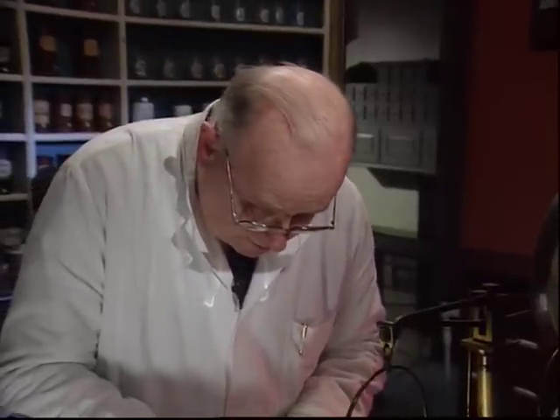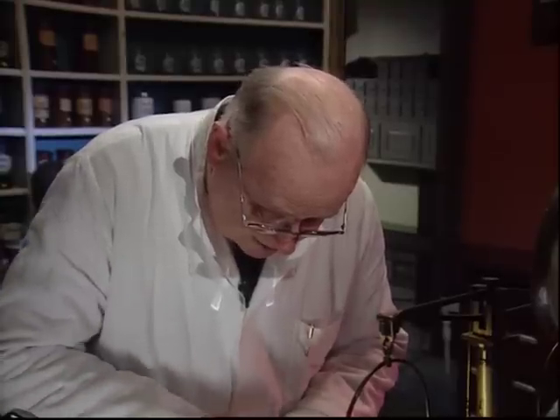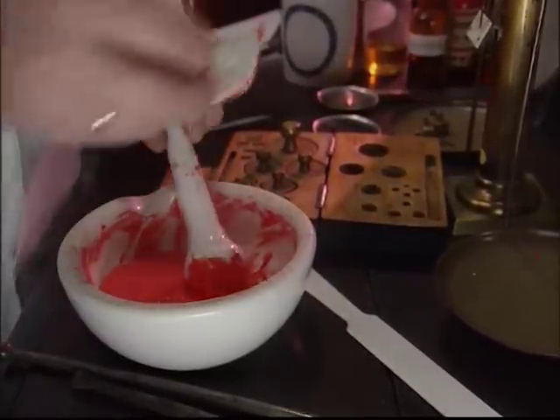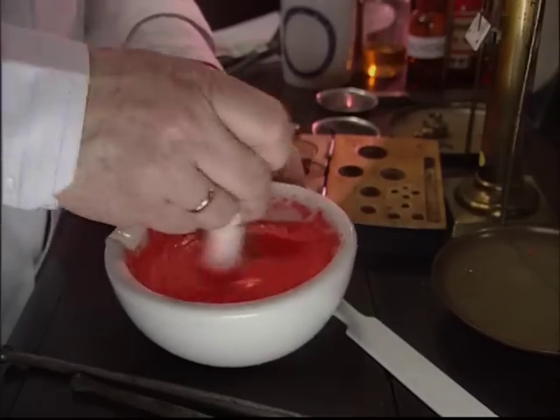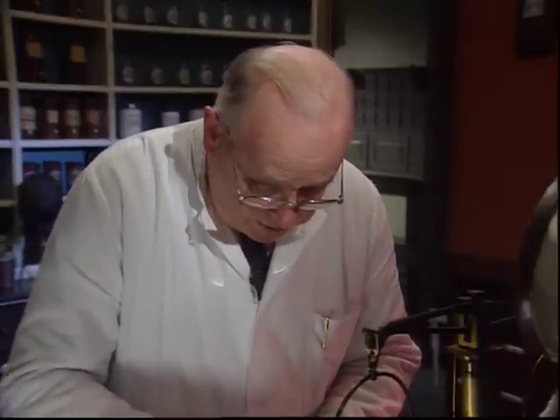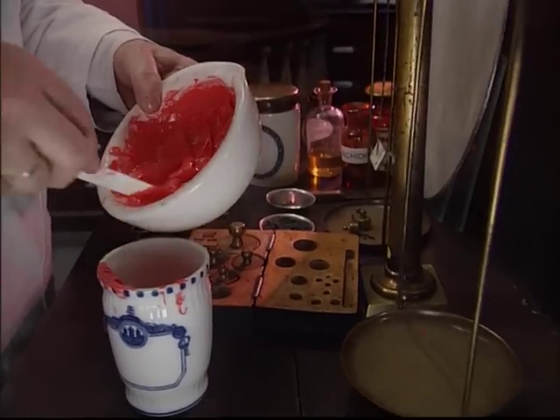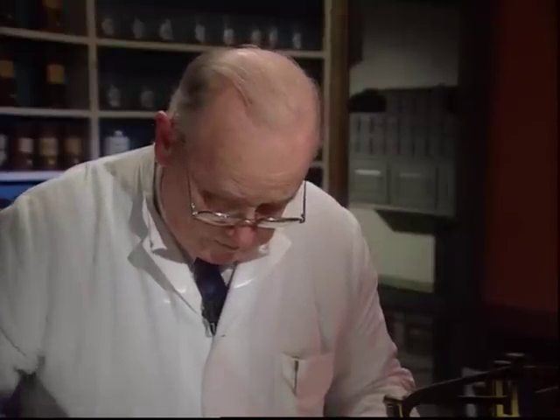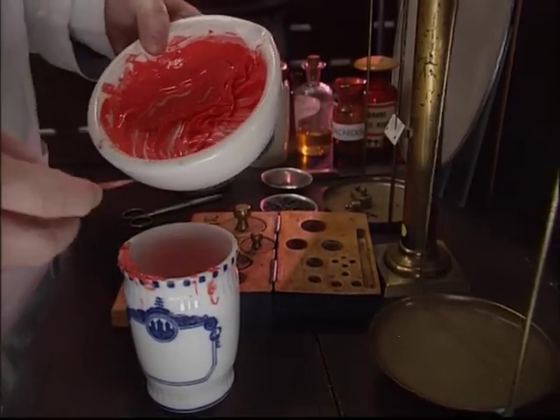In order to make sure that an ointment is blended sufficiently, even small traces on the side of the mortar and on the pestle must be retrieved at least 3 times. And it won't be long now before it's ready. This ointment won't be needed straight away, so we'll put it into an ointment jar. And take the remainder with our playing card.